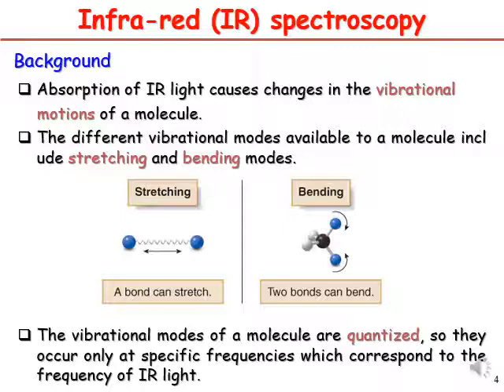So we can see that this is stretching, just like when you wake up and stretch your body, the same goes for molecules. They also do stretching. So what I can say here, a bond can stretch. The bond is not fixed, so it is flexible, and it will stretch and bend. They will have this kind of motion in the molecule.